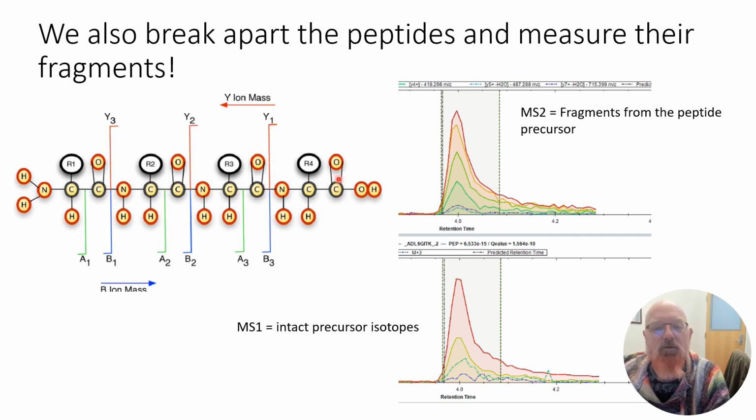Okay, so as the peptides enter the mass spectrometer, or after they enter the mass spectrometer, sometimes before, but you don't want it to happen before, sometimes they are fragmented. Those peptides will fragment in predictable ways, mostly, and give you fragments of the peptide that will have different masses depending on where they fragment. And usually this fragmentation happens at the peptide bond under collision-induced HCD or CID, collision-induced dissociation. So for example, this peptide will fragment into fragments of the original peptide.